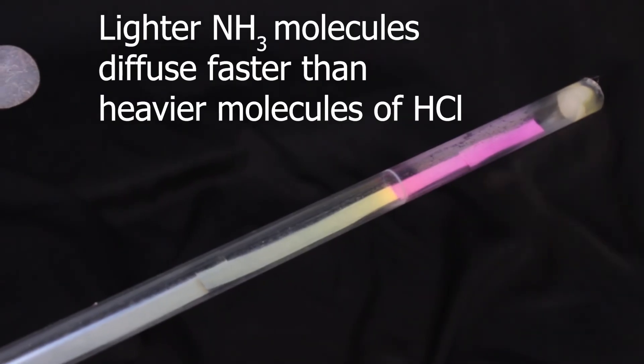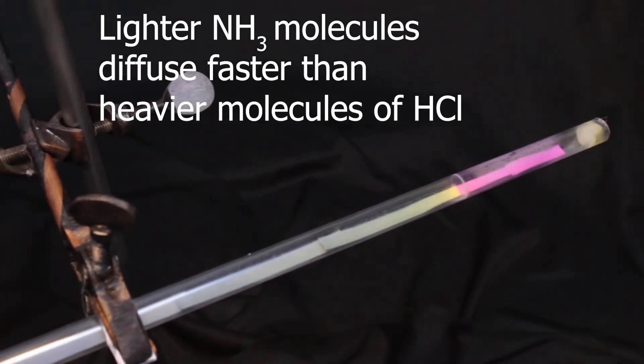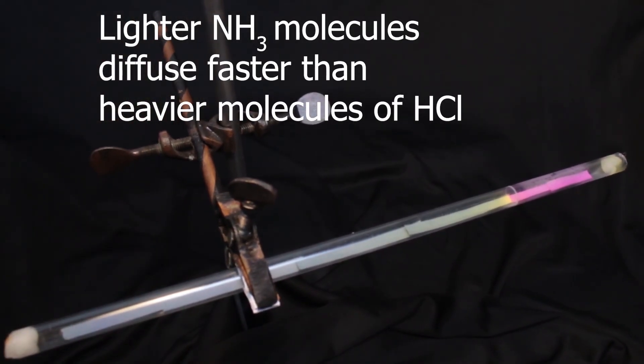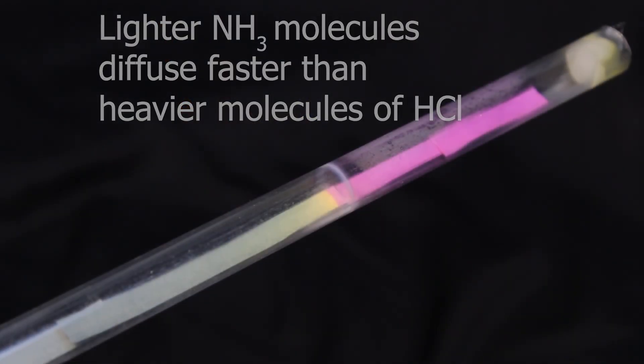You can see that the formation of this white ring took place very much to the right. It means that ammonia has traveled during diffusion a much bigger distance during the same time, compared to hydrogen chloride, which confirms our idea that lighter molecules diffuse faster.